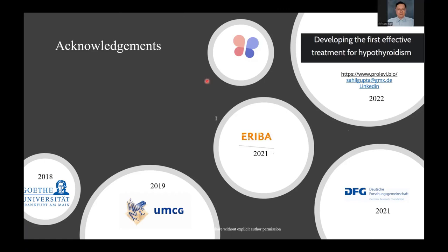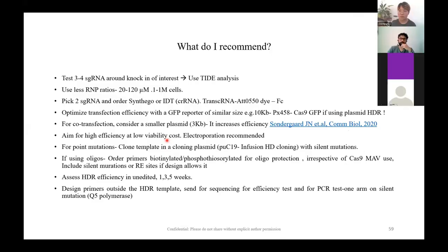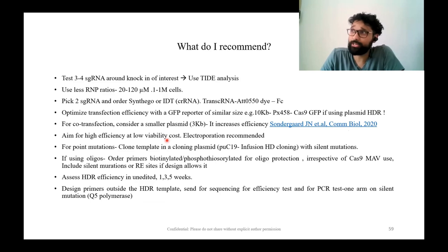Maybe I have a question. Sahil, very nice talk. So could you comment on, I know you comment on NHEJ repair, could you also comment on MMEJ, microhomology mediated end joining repair in your work? Yeah, so that's a really great question. Unfortunately, I do not have experience with that, but I've read publications where people are using just these 20 base pair homology repeats for targeted insertion.